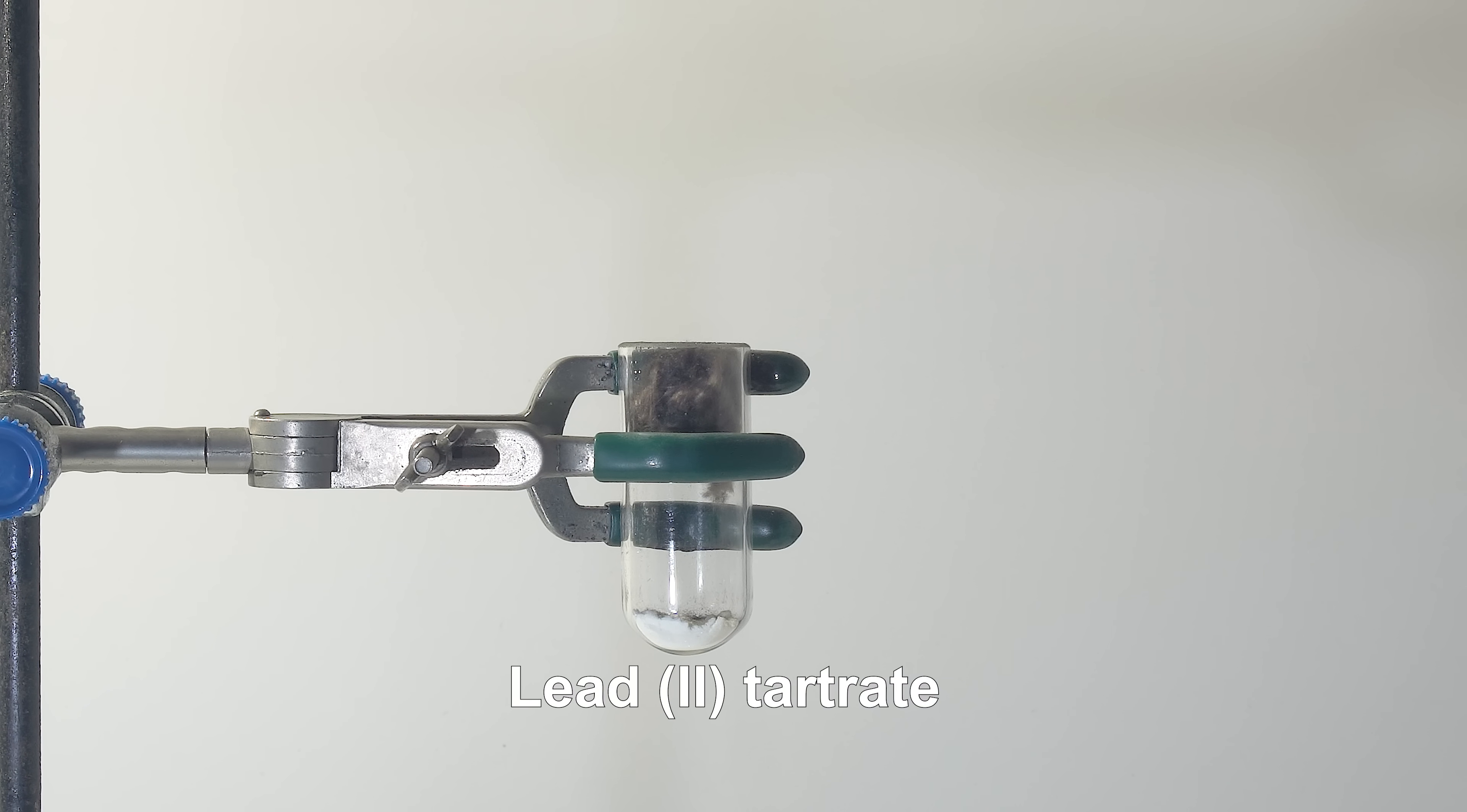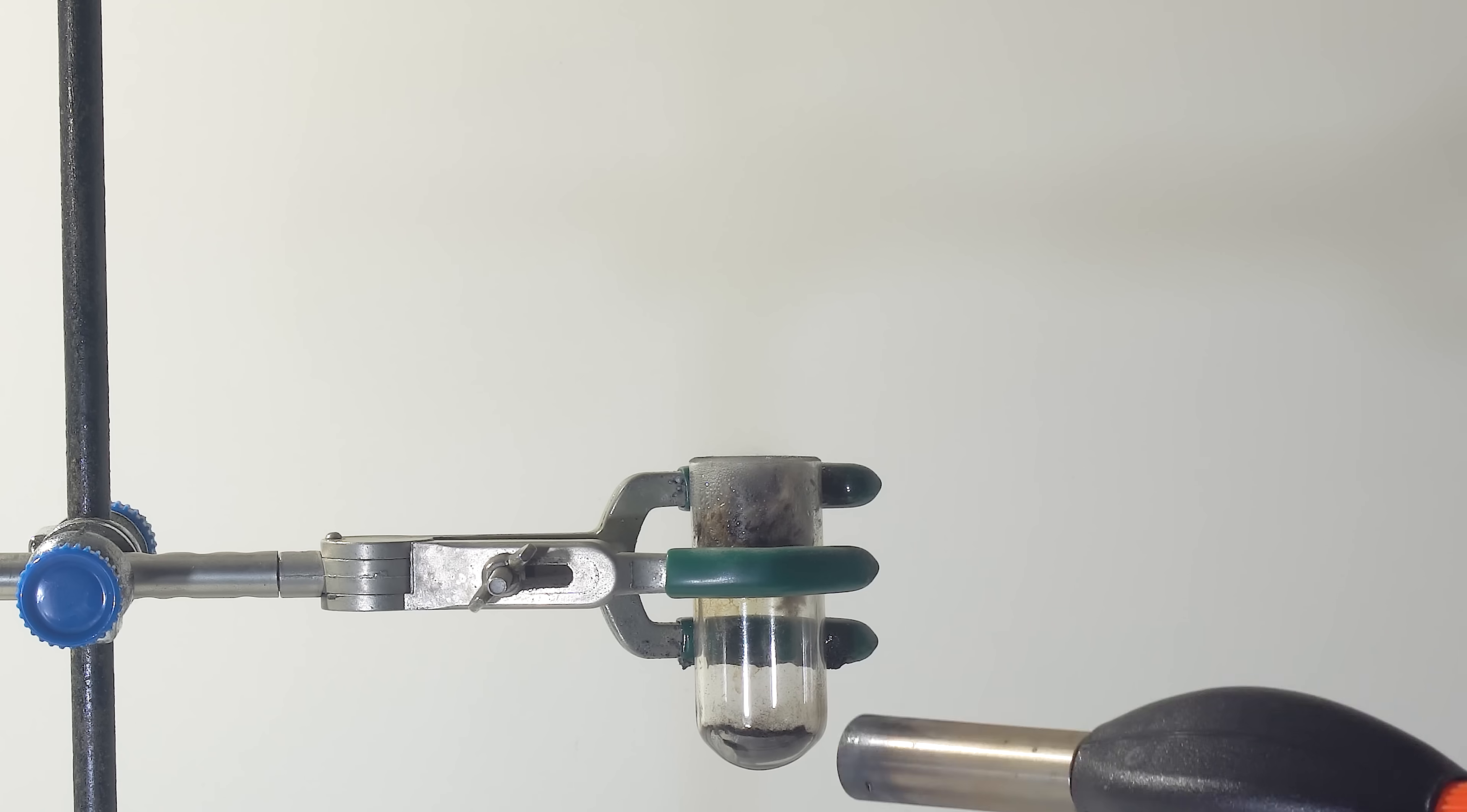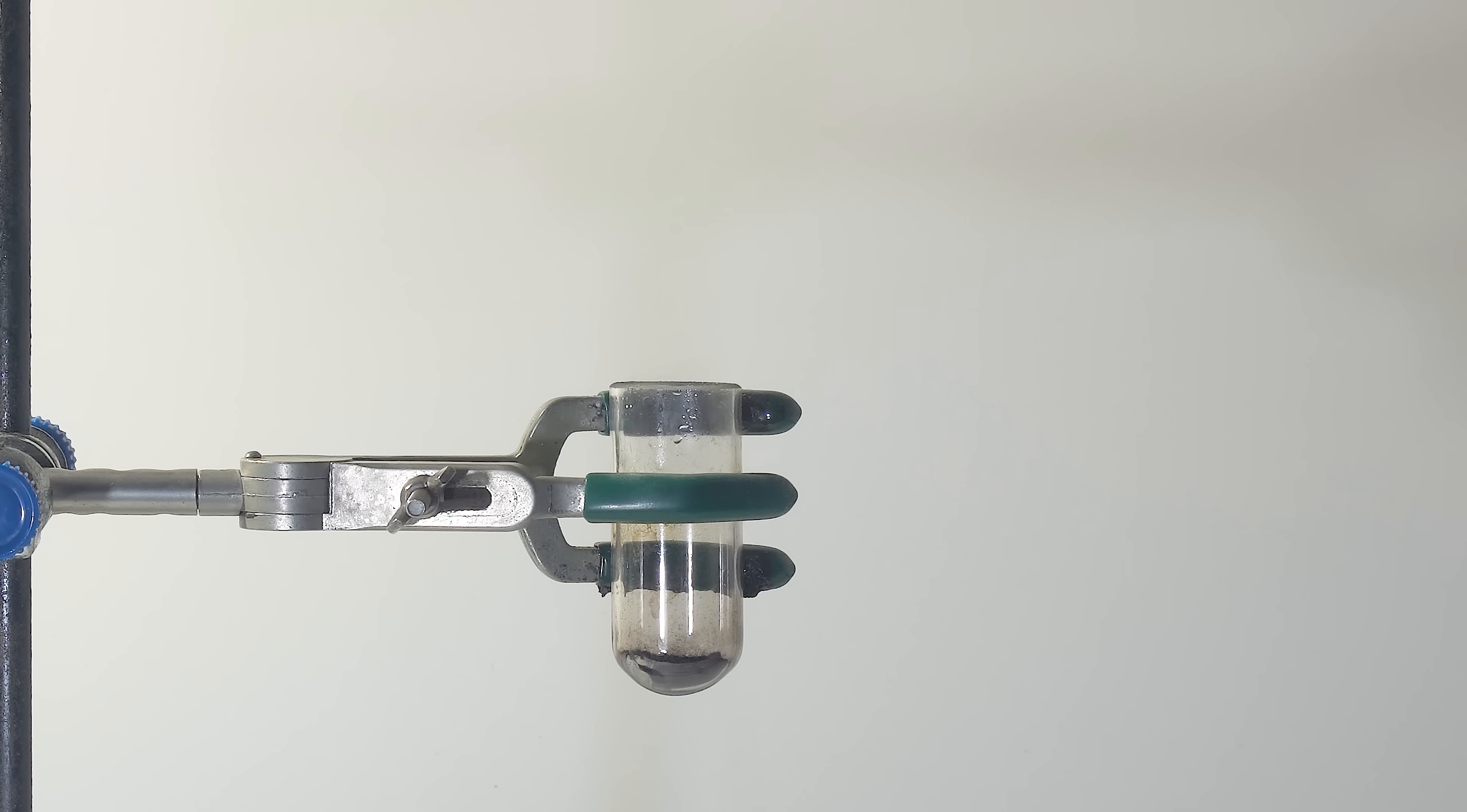Now, let's carry out the reaction in reverse. In a wide test tube sealed with cotton wool, I'll decompose lead tartrate by heating. After this, I'll remove the cotton wool and add liquid oxygen to react with pyrophoric lead.